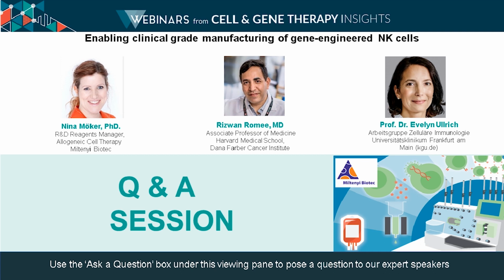As a matter of fact, as far as I know, Miltenyi is the only vendor which has experience with the baboon-based lentivirus system. So that's been one of the biggest challenges for us personally. We have a product almost ready to go to clinic, but it's a long waiting time getting access to the GMP grade lentivirus system. And then obviously once you have that, you can do some validation runs and then apply for IND. So it's a lengthy and expensive process.